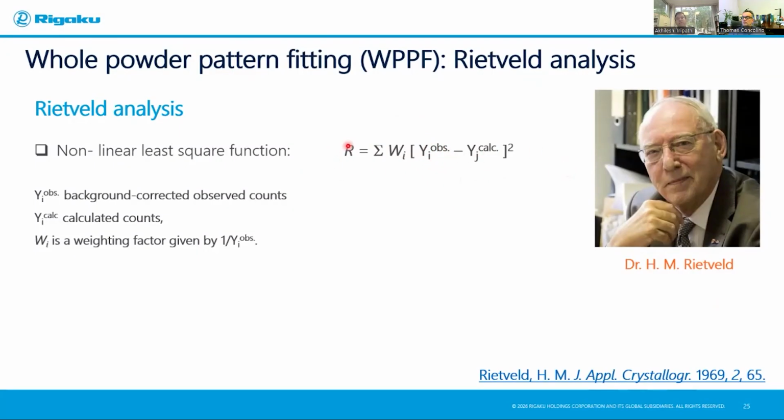So this sort of equations are used a lot nowadays, but originally Dr. Hugo M. Rietveld presented in his PhD thesis, and in the open literature, that this sort of program will bring my pattern very close to the original pattern, and I can know everything about the pattern. So this is known in several versions of this software, such as GSAS, general structure analysis system, FullProf Suite, MAUD, or Ritica. These are all other programs, very detailed ones, exactly on the same principle by Dr. Rietveld. So that's the idea of Rietveld analysis.